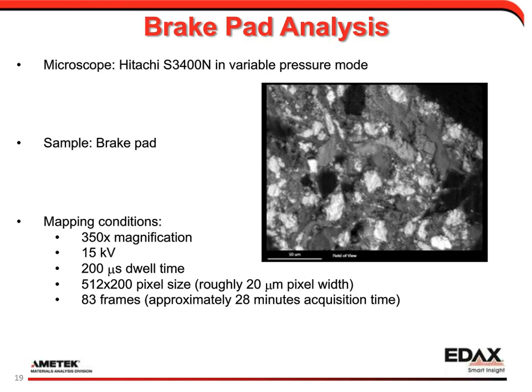But if we're talking about 1 atomic percent of boron or carbon, then it gets much more challenging. So it depends on the element and it depends on the sample composition. But yes, we can do analysis in the low concentration range, but it does depend heavily on the sample in question.